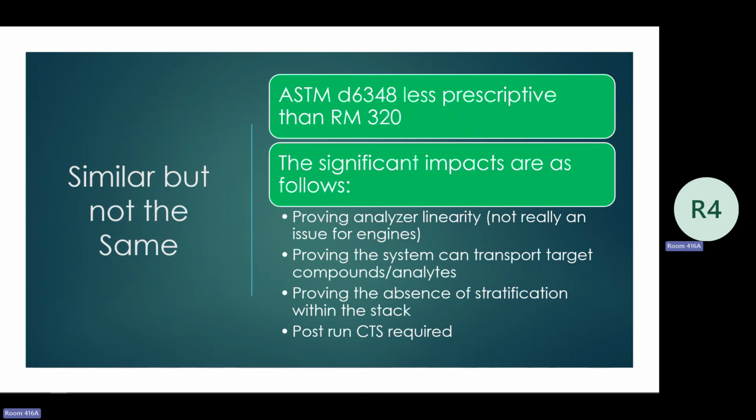And if you fail your spike recovery at the end of the test, all runs are invalidated at that point if you didn't do a post spike recovery. I'm sorry, post spike recovery after each test run.